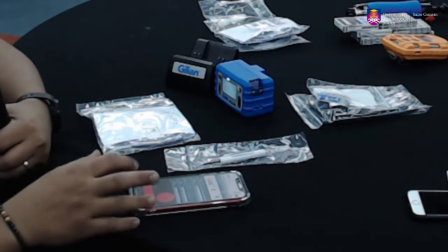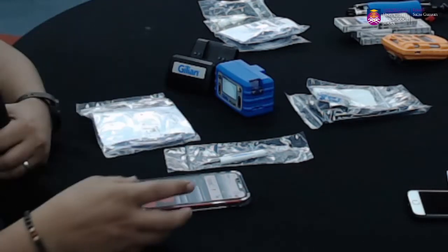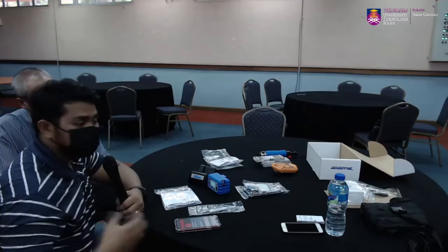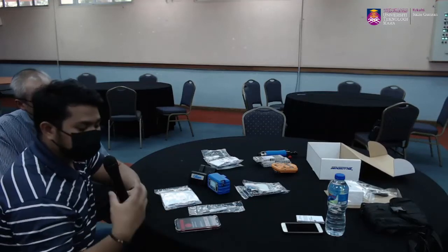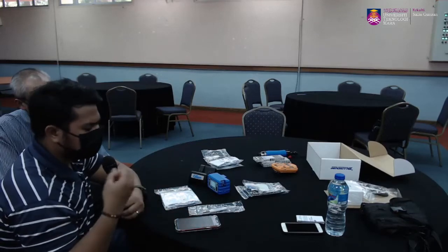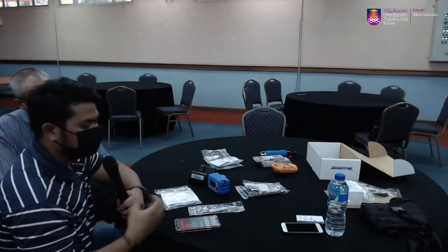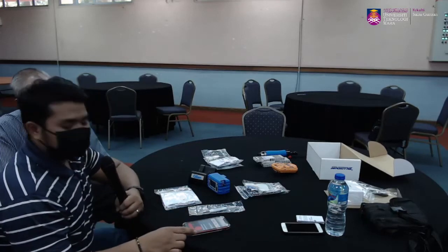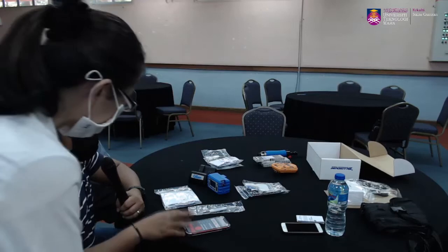This is the additional part. Selalunya bila kita pasangkan dekat site, kita tak tahu whether the worker is using that while dia working ataupun dia tinggal somewhere. Sebab sometimes kita tak tahu macam mana dia punya work etiquette. So kalau contohnya dia rasa uncomfortable, dia tak suka ada pump ni along with them. Kalau dia orang tinggal, kita boleh tahu dia not moving. So kalau dia moving, means that it's active.